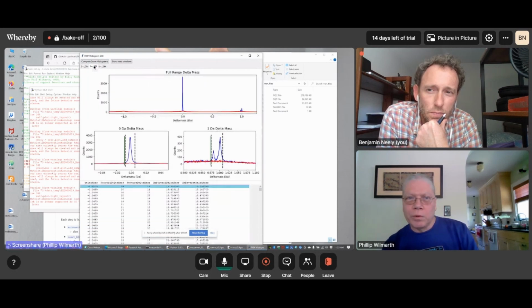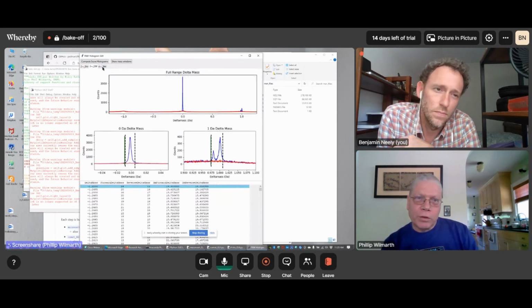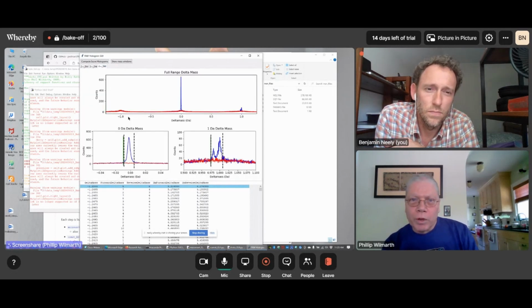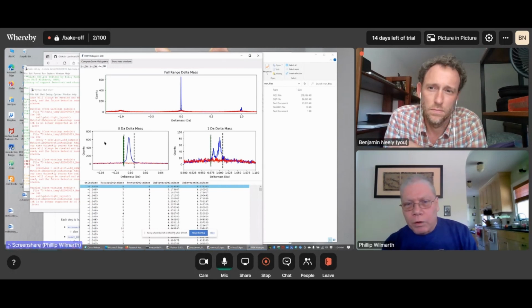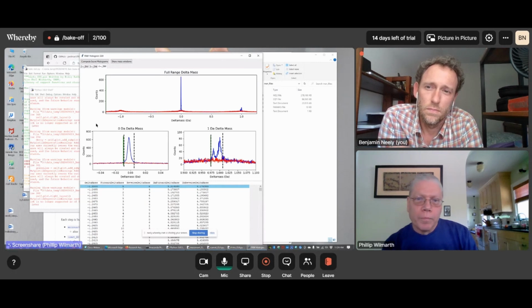And we've got a similar situation for 3+ peptides. And typically in these experiments, identifications are about 2 to 1, 2+ peptides over 3+ with trypsin. But we also have a very small number of 4+ identifications as well. The heights of these histograms tell you the relative amounts of these different classes of peptides. And 4+ would recover enough to make it worthwhile, but it might be on the order of 2 or 3% identifications for 4+ with trypsin. So here I'm not going to tweak any of the thresholds.